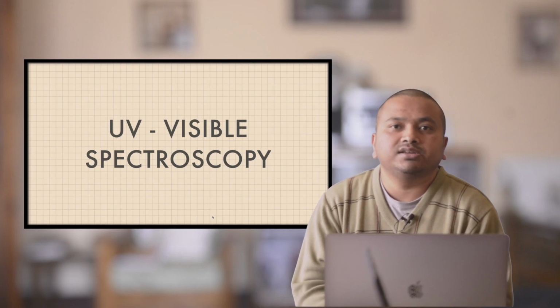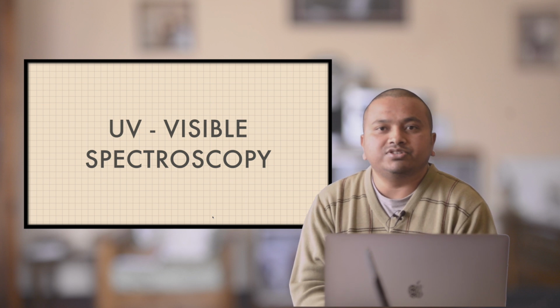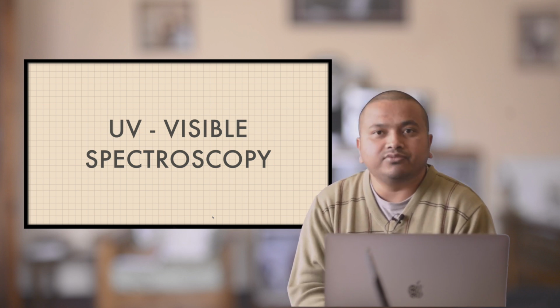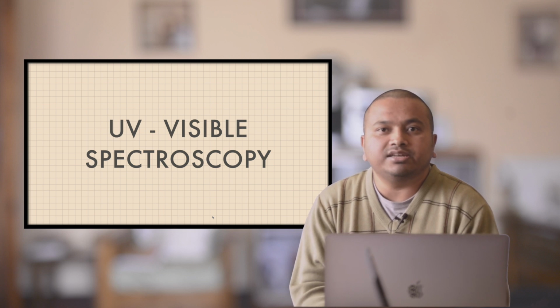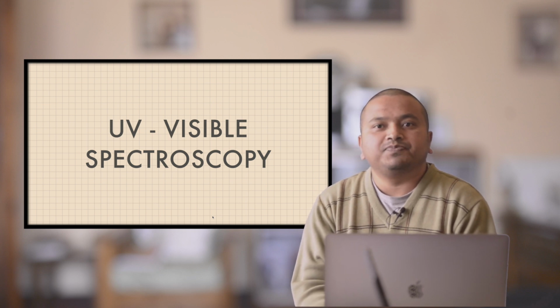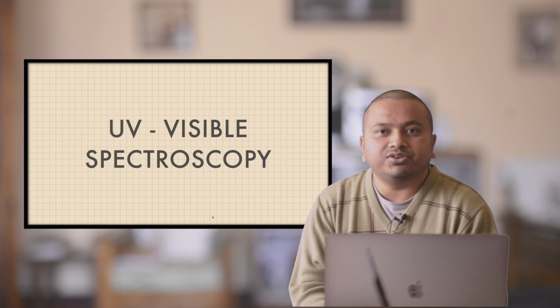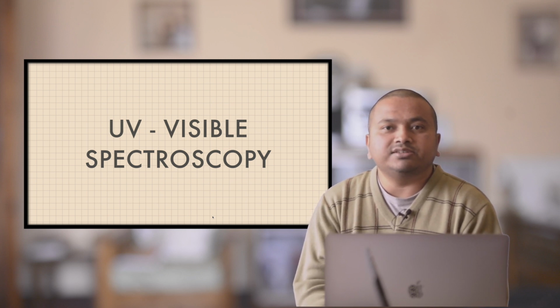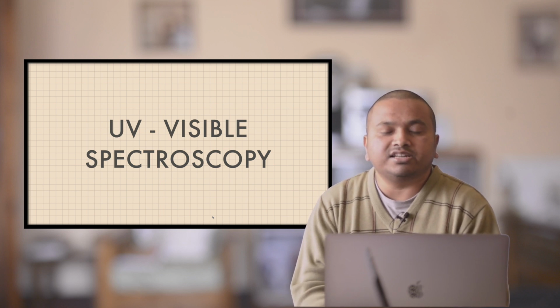So with this, we have come to the conclusion. I hope you are clear about the working principle of UV visible. We have also relooked at molecular orbital theory and how through this theory you can see that the more the conjugation, the lesser the energy difference between the different transitions, pi to pi star or n to pi star.